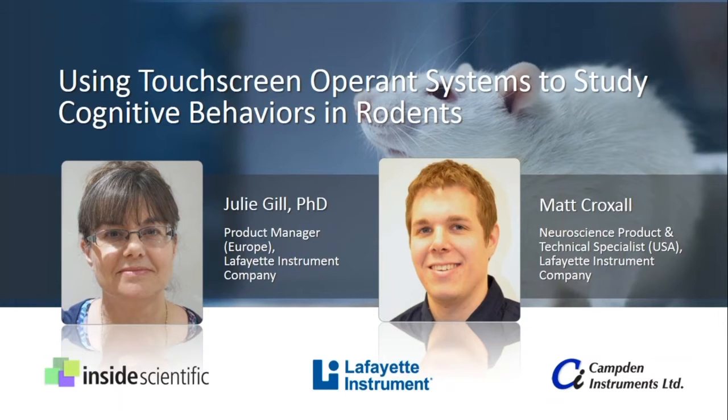They will review the animal test environment and provide an overview of both hardware and software requirements. They will review the broad range of tasks available for neuronal targets, show some of the data obtained during testing, and also talk about integration of the Bussey-Saksida chamber with other systems such as electrophysiology, optogenetics, and video tracking.